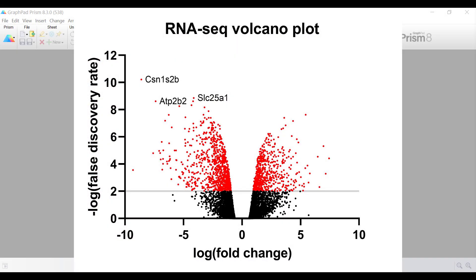A volcano plot is a type of scatterplot that is used to plot large amounts of data such as RNA-seq data, as shown in the example on screen. Here, over 15,000 genes have been analysed, with each data point indicating a different gene. The x-axis depicts the log fold change, and the y-axis shows the negative log false discovery rate, or FDR.